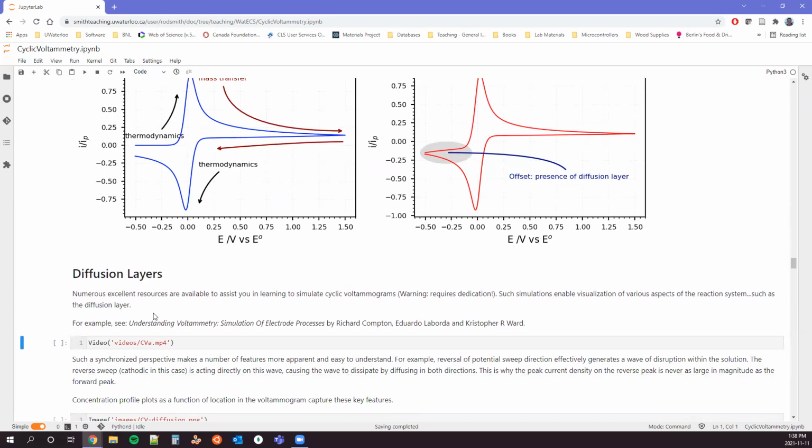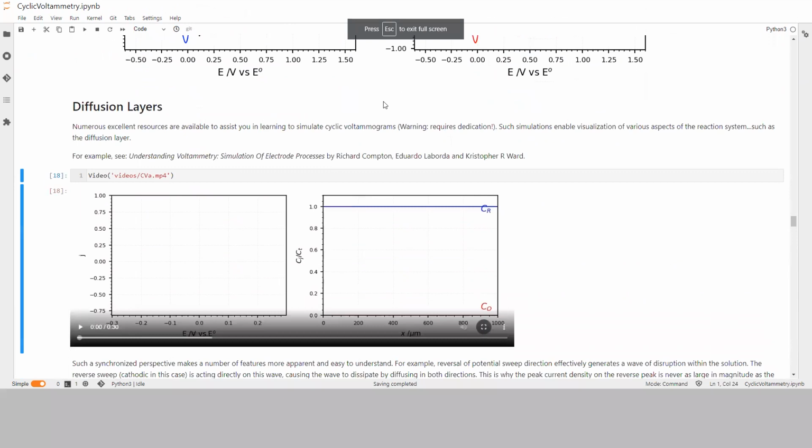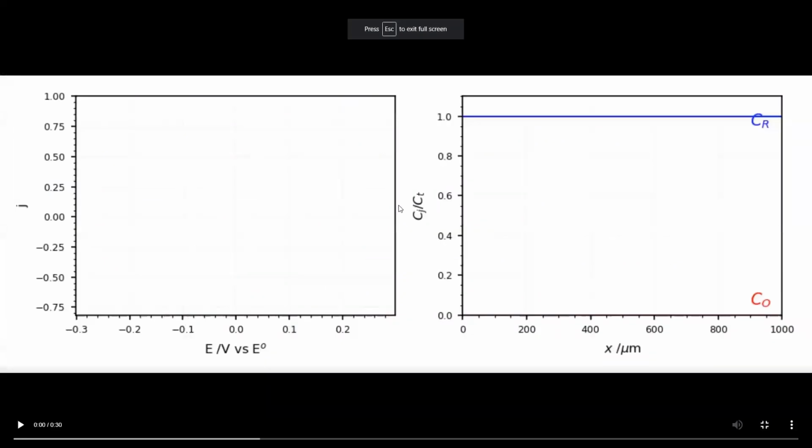I won't go into all the details here, but we can very easily simulate these simple situations. And so if you've not tried simulating electron transfer processes, Richard Compton over in the UK is probably one of the best sources to learn from. He's got a number of review articles and textbooks published on the matter. He's got a good selection of practice examples that he walks you through so that you can learn how to do it. But all I've done here is animate what we should expect to see.